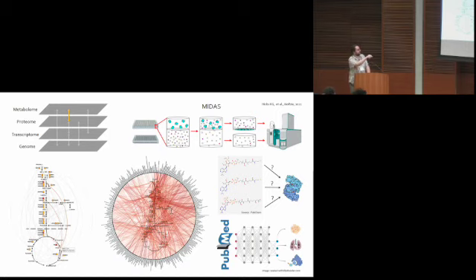We see a lot of these interactions where, for example, here we're highlighting citrate synthase. And yes, it interacts with citrate, which we expect, but then it's also interacting with all these other steps in the pathway. And so we're working on following up on some of these hits and validating those. But then I think when we expand this, so here we're only looking at the metabolites that are annotated in central carbon metabolism. When we look at the entire Midas pool, we see that this metabolic regulation is extremely complex.